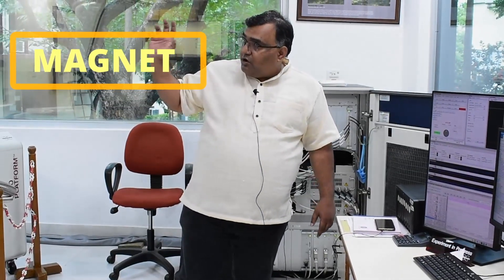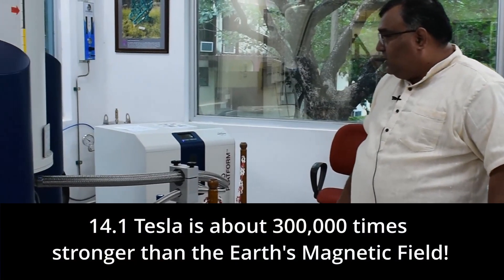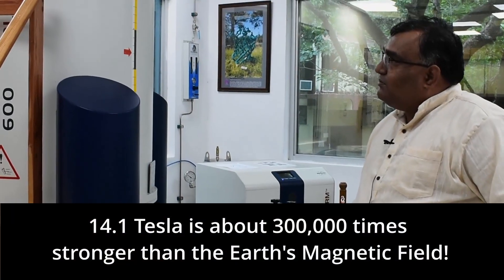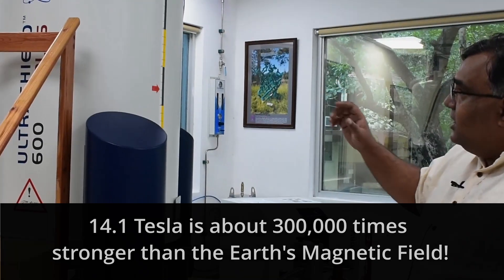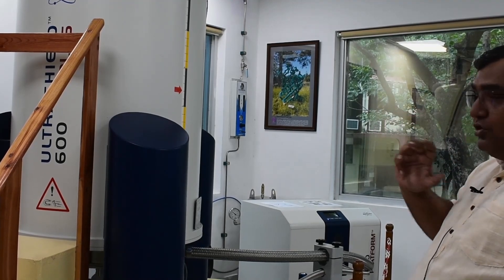The first and foremost component of any spectrometer is a magnet and here you see a magnet which is a 14.1 Tesla magnet and this 14.1 Tesla magnet is essentially created using superconducting technology.